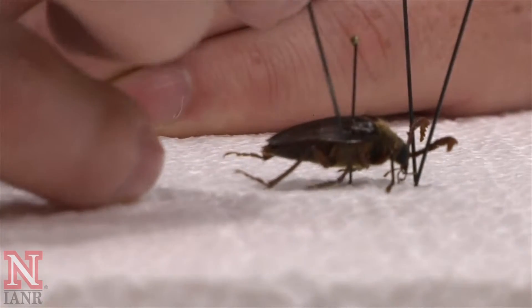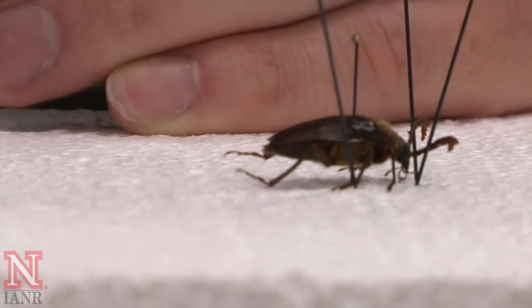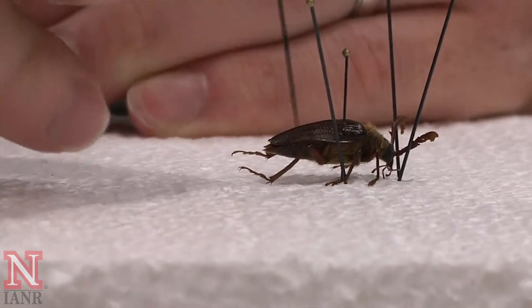It is important to position the legs and the tarsi — or the feet — in such a way that they are observable.